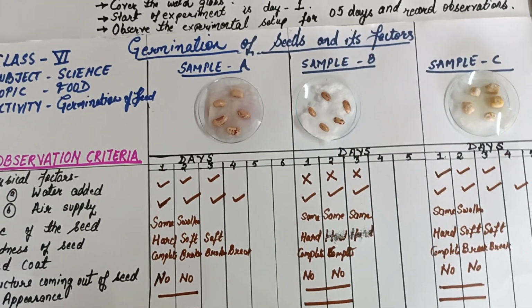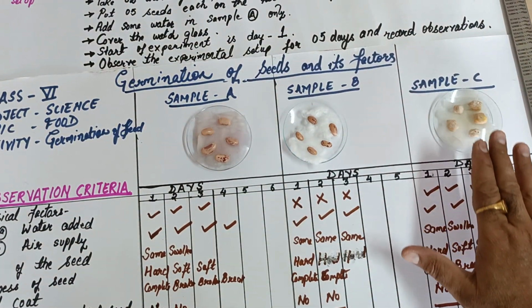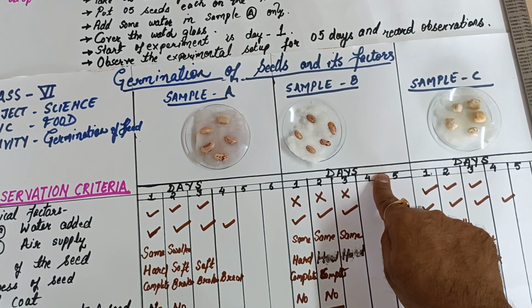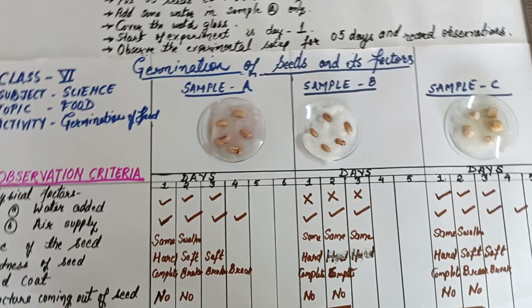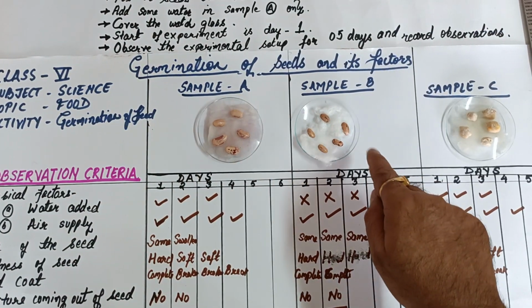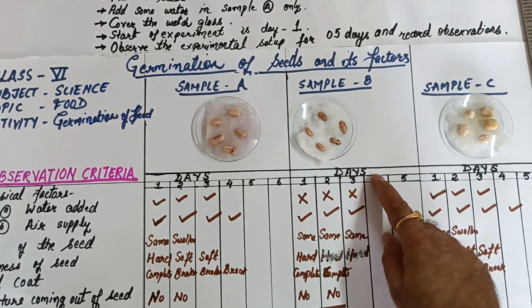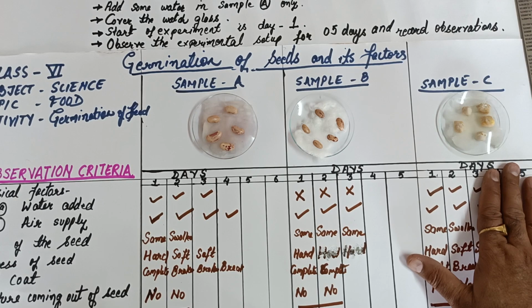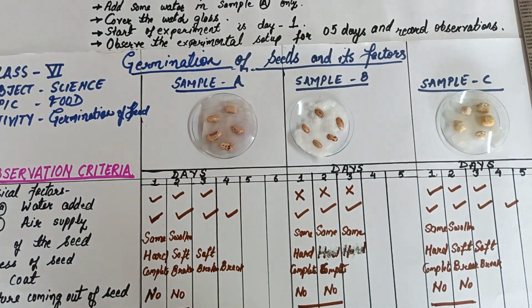The 4th column we'll not be using at present. Actually, the 2nd and the 3rd column have our experimental setup that involves sample A and sample B. We have kept sample C also ready under the same settings, but the seeds are different.